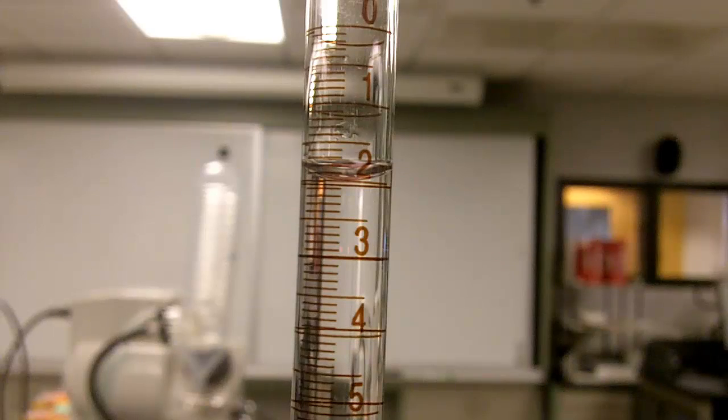And just remember what you do to find the volume that's dispensed is take your final number, which in this case is 1.90, and subtract your initial number of 0.21 from that to give you your overall volume dispensed.